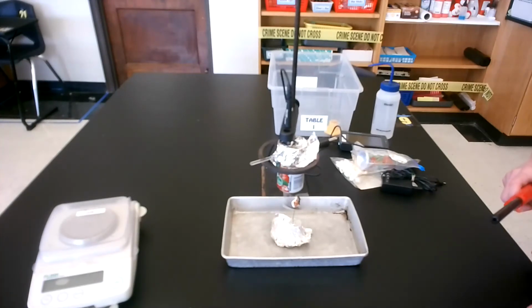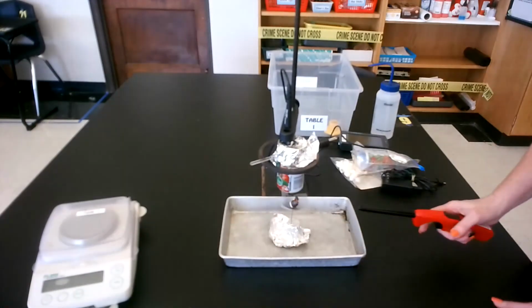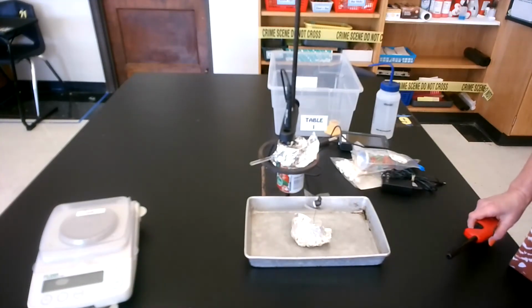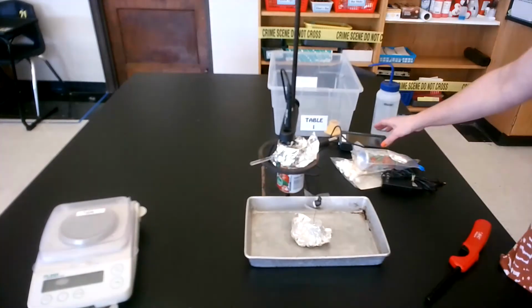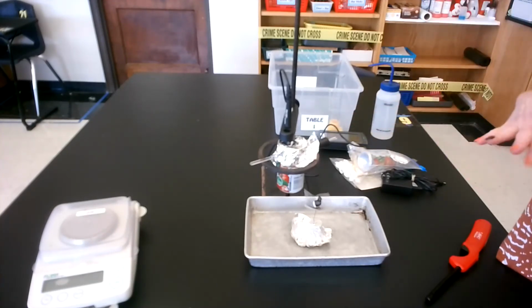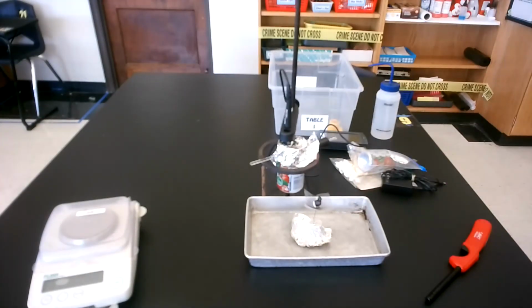Some foods are a little bit harder to light and stay lit, so you may be moving this a lot. I might need to come from the bottom side. I want this completely black in color until it can't burn anymore. All the energy's been burnt up. So that's why someone watching the temperature is so important. When that temperature either is maintained or it starts to drop, things start to cool down, take that highest temperature.